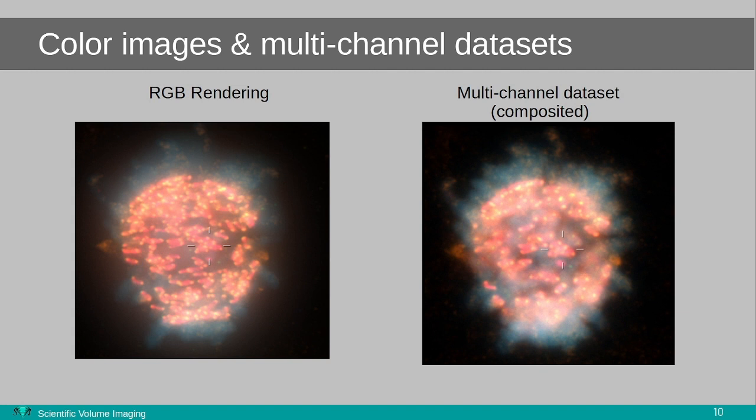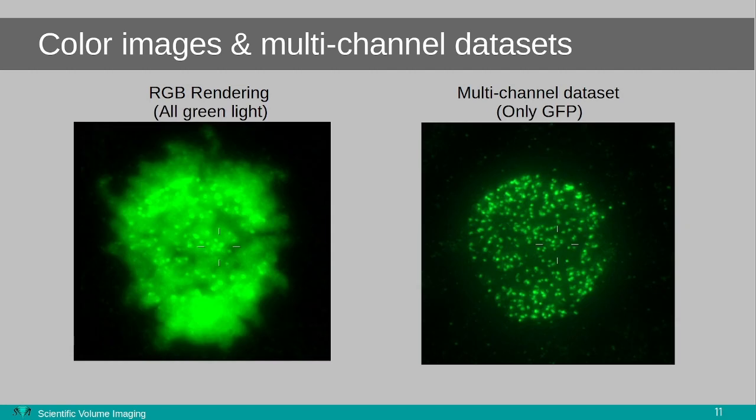Both of these images look really nice, of course, but an RGB image cannot tell you much about the individual concentration of your fluorophores, and therefore it cannot relate to your object of interest. The second type, in this case multi-channel images, do allow you to do correlative or quantitative comparisons between multiple fluorophores or multiple objects, and should contain signal that directly correlates to your isolated objects.